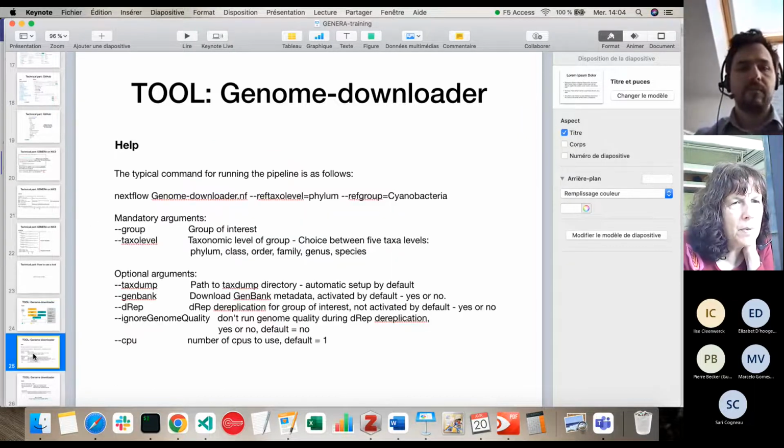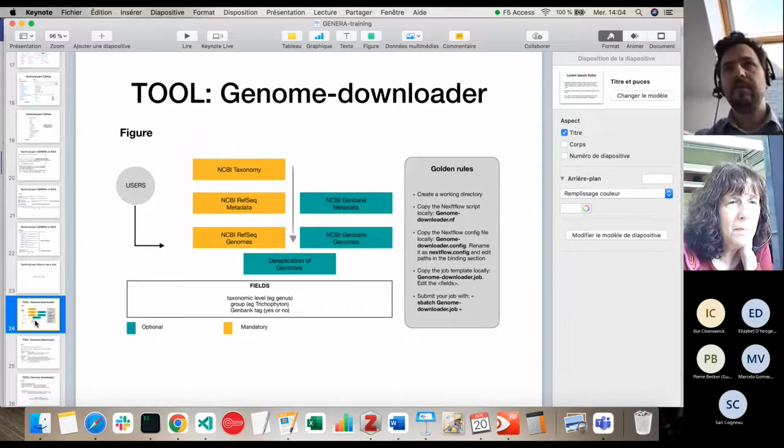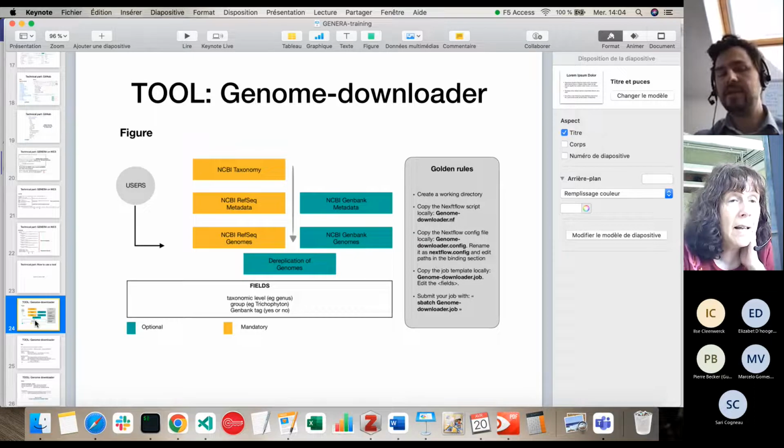Sorry, is it 100% or can you say I dereplicate at 95 or something like that? No, it's prefixed, but it's not an average nucleotide identity. It uses MASH, not ANI. So the thresholds are a little bit different. But here the threshold is fixed in dRep. But I think I can add a threshold option, and roughly yes, you can say 95% or something like that. So it can be an option to add. Currently, I think it's 95%.